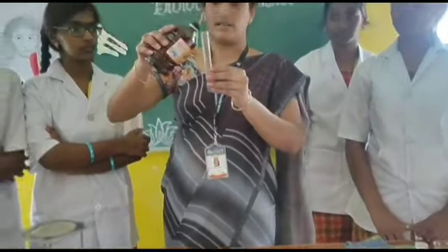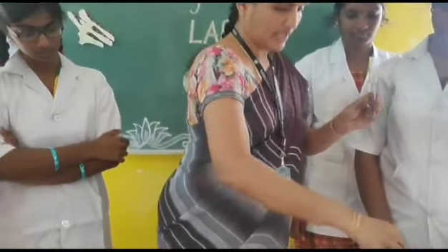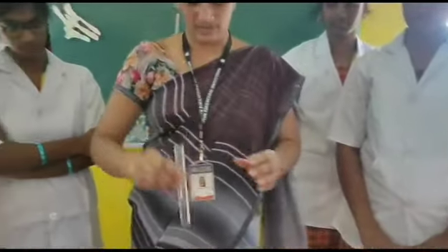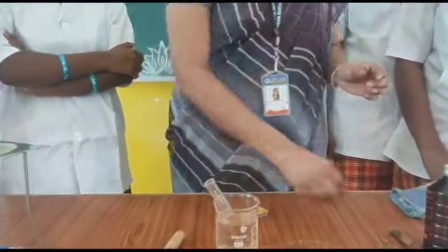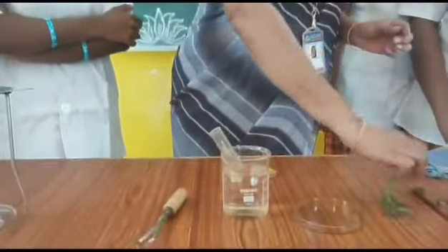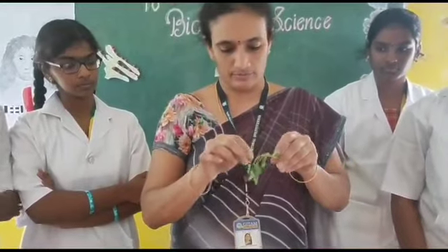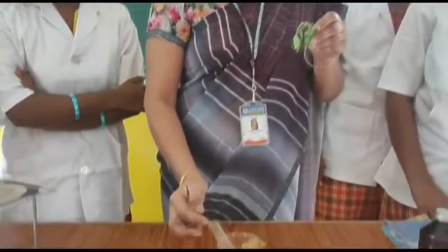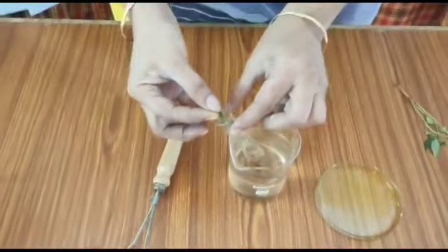We have to pour some methylated spirit into the test tube, which is placed inside the beaker containing water. We also need one or two leaves, which we have to place in the test tube containing methylated spirit.